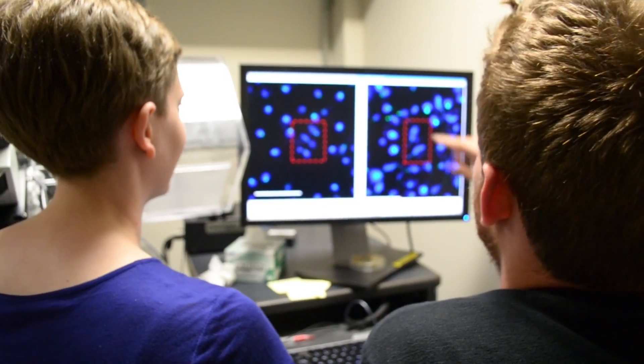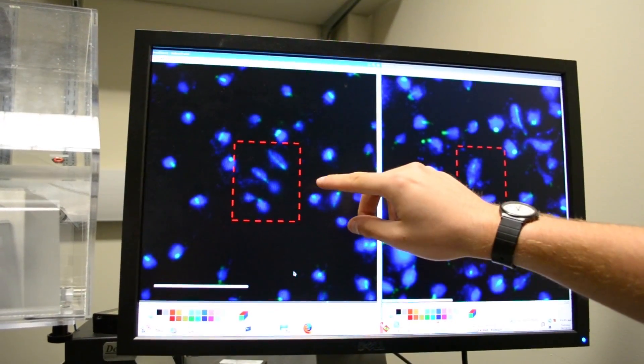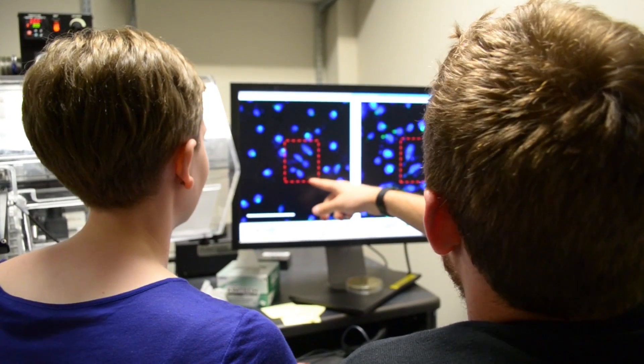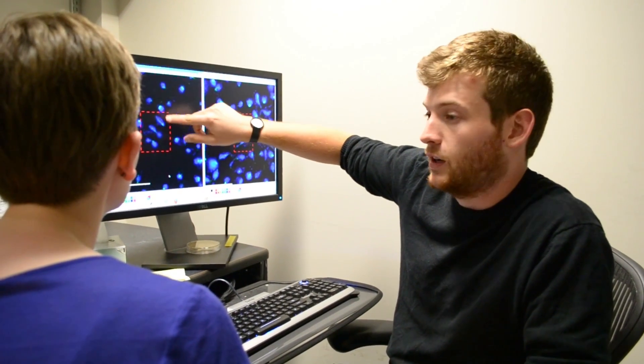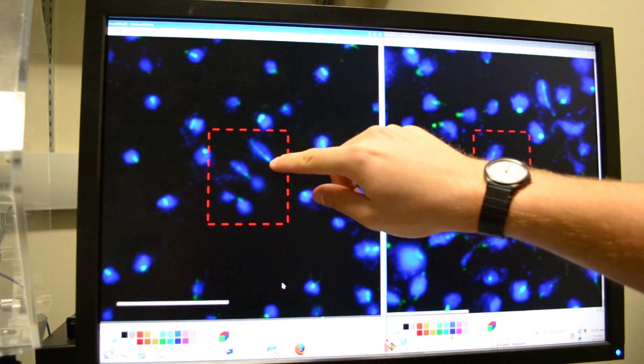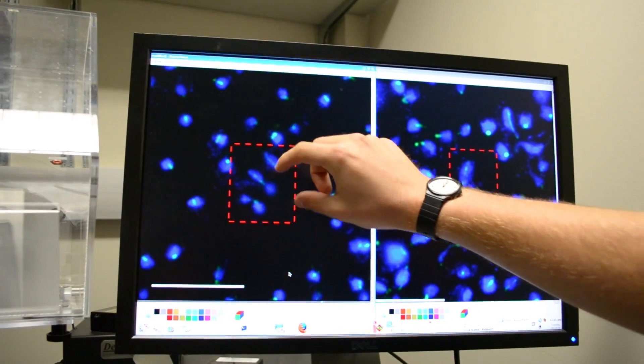As you can see, we have dividing cells here. Labeled in blue is the DNA and you can see the two circles are separated away from each other, so this means that mitosis is working nicely. You can also see labeled in green is our tubulin, which we labeled with the antibody. You can see the nice line of tubulin that starts to pull the DNA apart and then it breaks down as the DNA is separate.